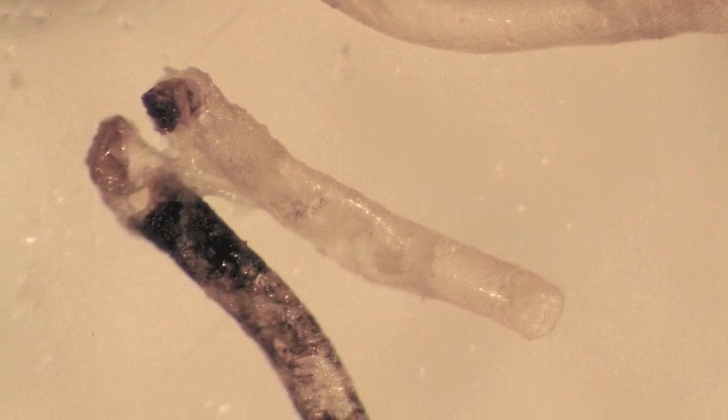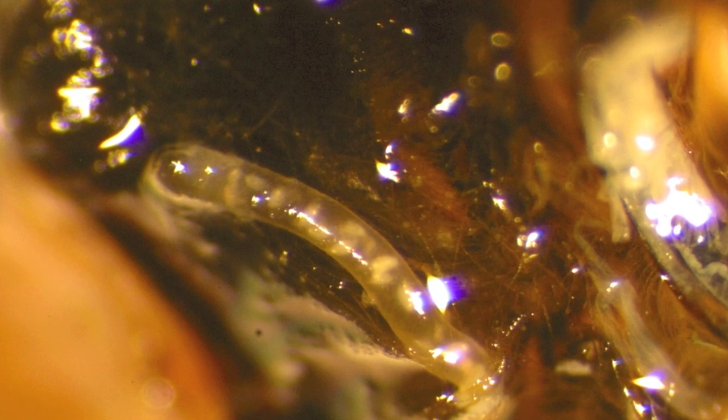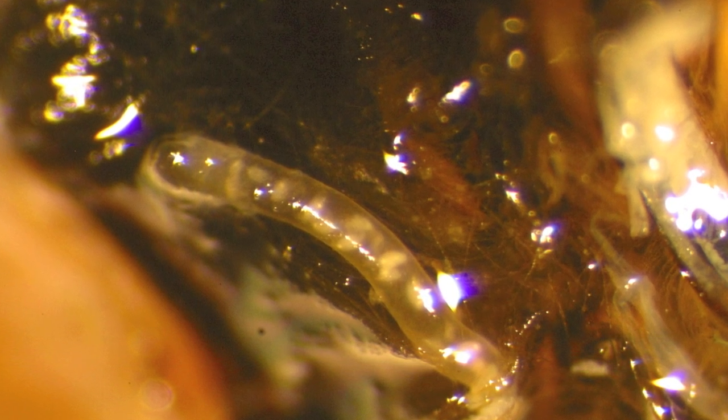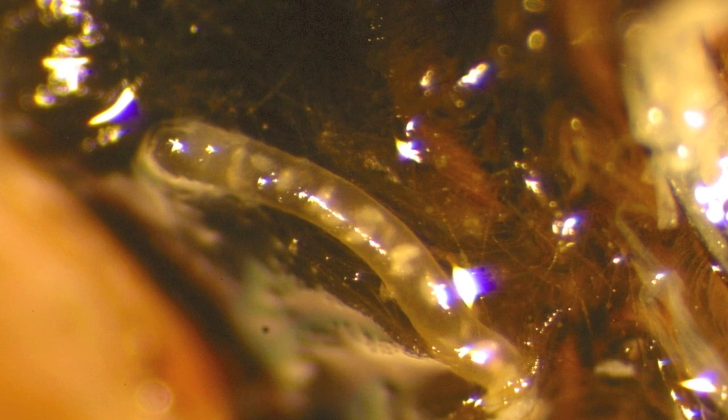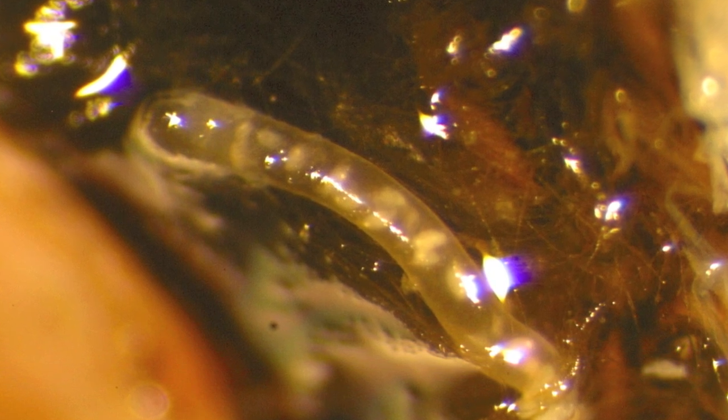So these tracheal tubes are not in good shape. This tube is an example of a highly infested tube with eggs inside — you can see those little white oval shapes, those are eggs. We've laid it on the thorax of the bees so you can get a good look at it. Sometimes we find tubes like that in addition to the tubes that just have the scar tissue like we saw before. These are actively infested tubes.